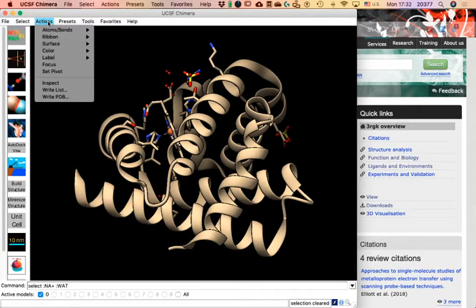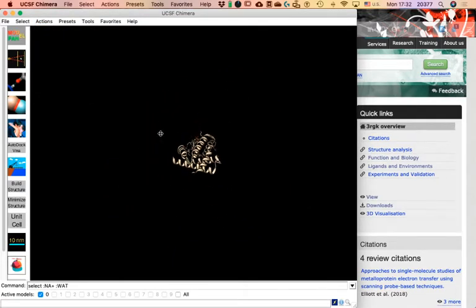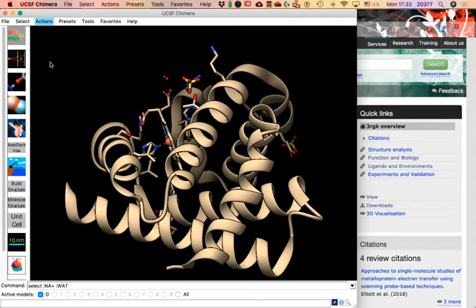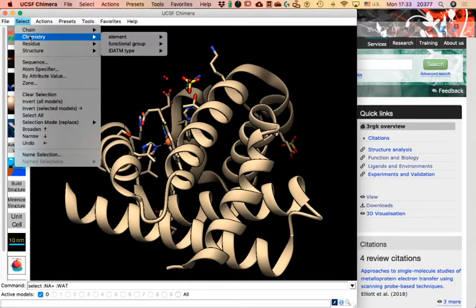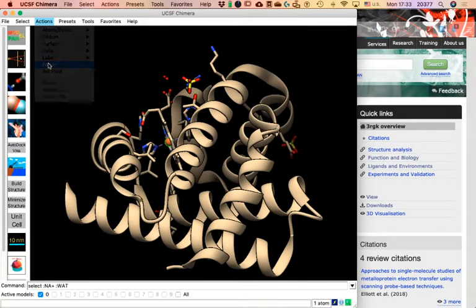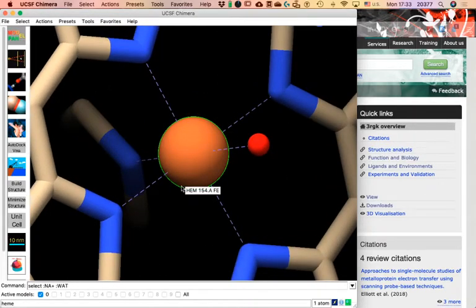Actions performs an action. When there's no selection, actions are applied to everything on the screen. For example, if I drag the structure away so I no longer see it, I can go to Actions > Focus and the program will bring everything loaded as close as possible to the screen. I could also use it specifically — for example, select the iron element from the heme group, then go to Actions > Focus, and the screen brings me as close as possible to that selection.